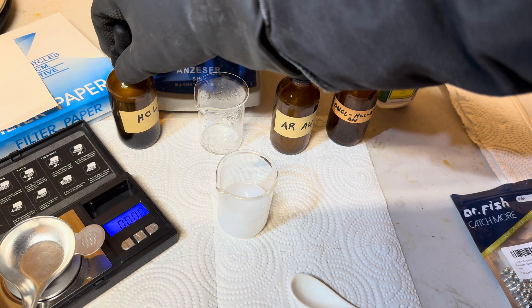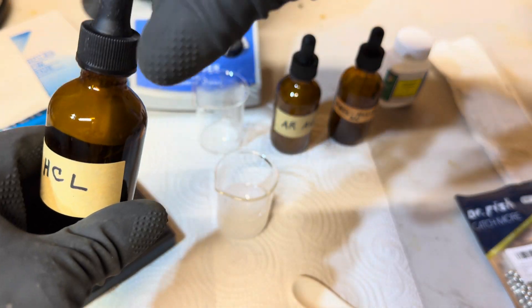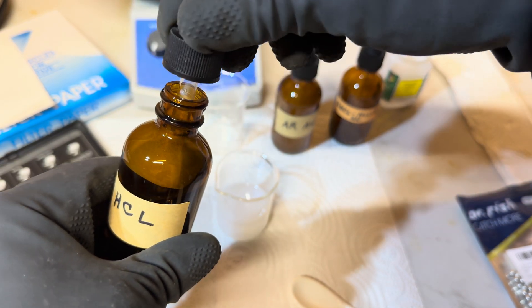Now, we will add in 30 or so drops of hydrochloric acid at 31.4%.